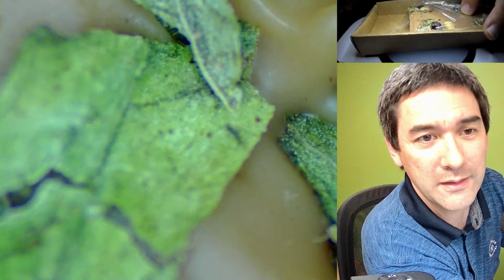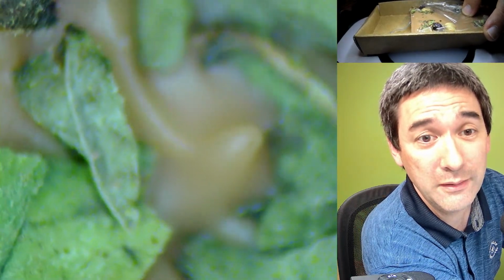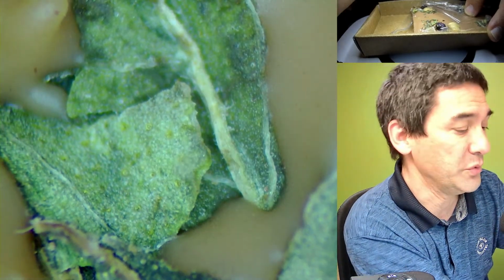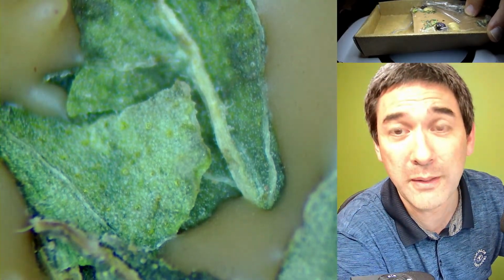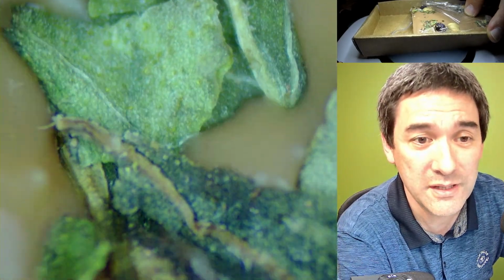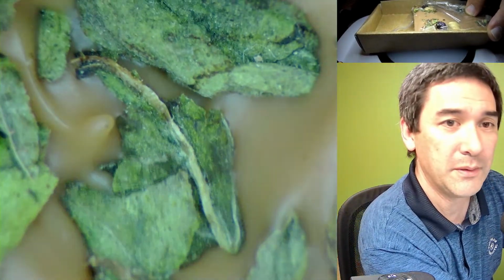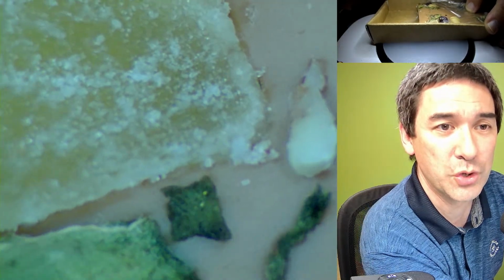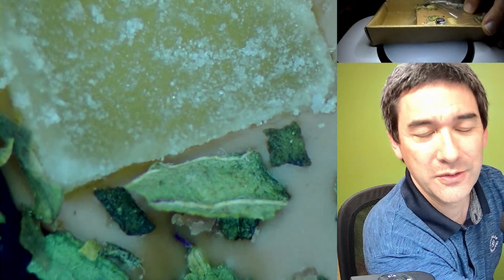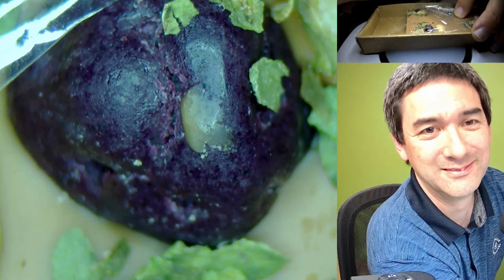And we can now look at some of the things here under the microscope. Actually, I'm thinking about the following. Maybe I could try to get one of those leaves here and put it under my compound microscope, simply by rehydrating it a little bit, and then see how much of the cellular structure is still visible. There's also some sugar here, some dried fruits, and a berry here.